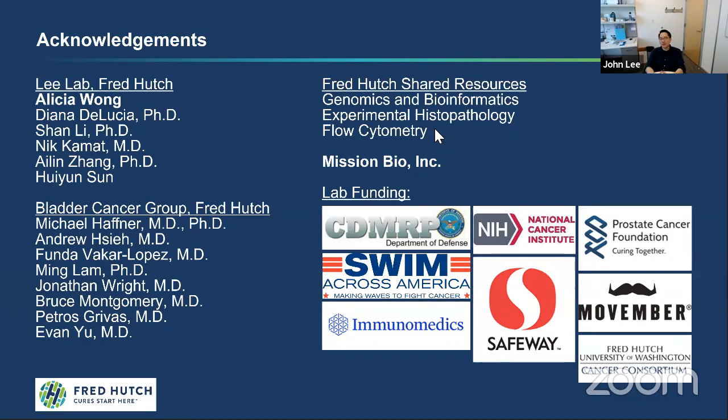What we're doing now, because we don't get in situ level clonal analysis when we're dissociating single cells, is we're doing laser capture microdissection, and then we're amplifying the barcodes from each of the regions and sequencing those to confirm that, in fact, the FGFR3 mutant corresponds to the region that looks like papillary carcinoma. Obviously, our validation experiments suggest that that is the case, but it's just good to have that as a confirmation as well.